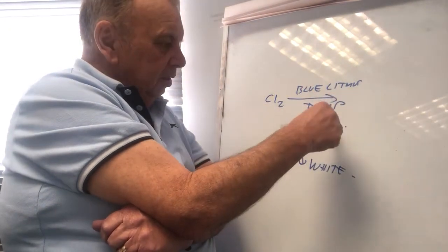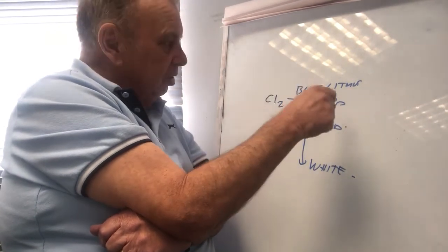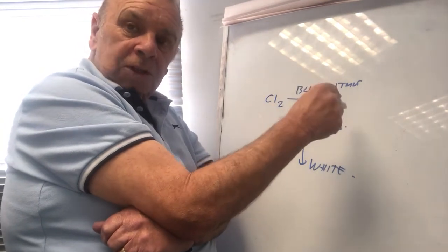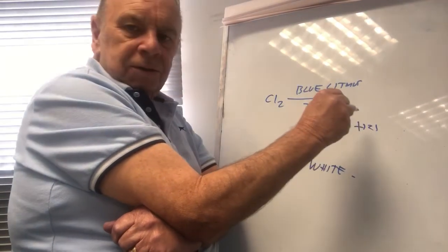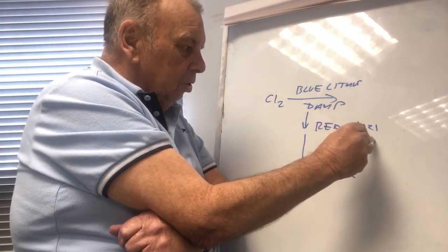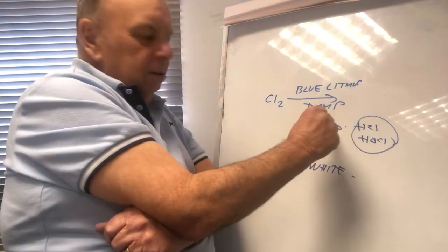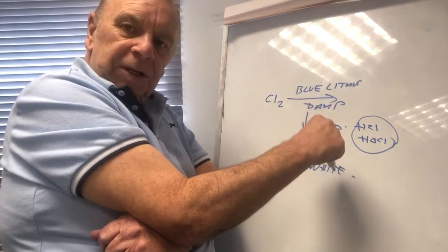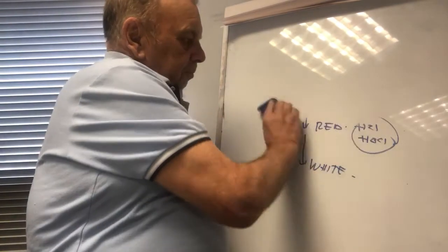And why it turns it red is because it has an acidic reaction with the water. That's why it's damp. In fact, it forms hydrochloric acid to start with, HCl, or hypochlorous acid, HOCl. It forms an acid. That's why it turns it red, and then eventually it bleaches the litmus white.